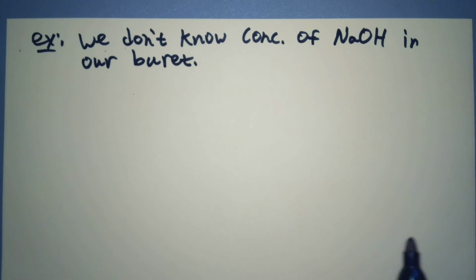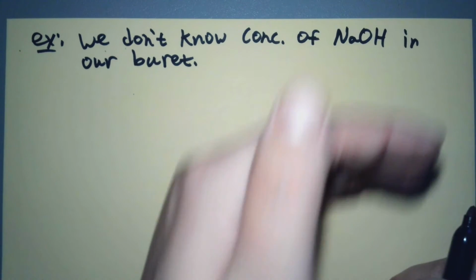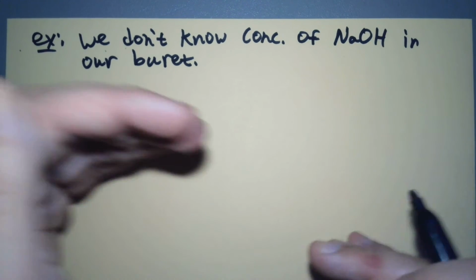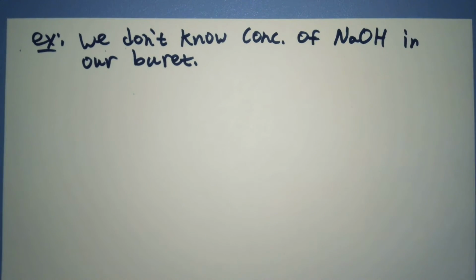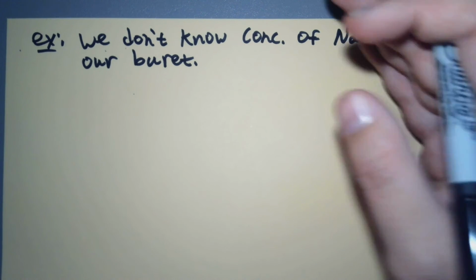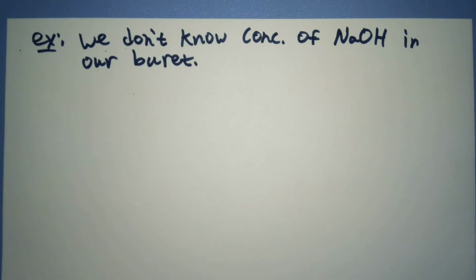If you were doing this lab in person, you would prepare a sodium hydroxide solution, and then you would have to standardize it, and then you could titrate an unknown with it. So it's a multi-step problem. Sodium hydroxide cannot be reliably massed on a balance, because water starts mixing in with it spontaneously from the air around it. So we got to figure that out.